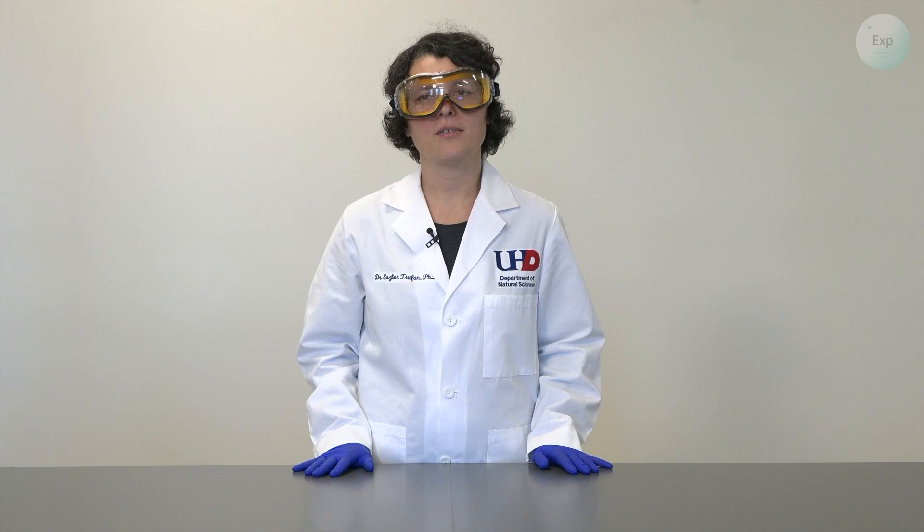Hello, my name is Dr. Esther Trufan, and in this video I'm going to demonstrate how the addition of sodium chloride can impact the freezing point of water or the melting point of ice.